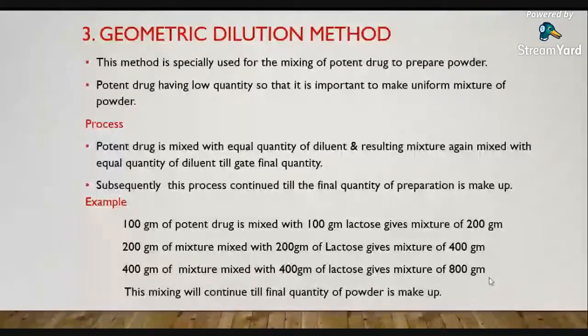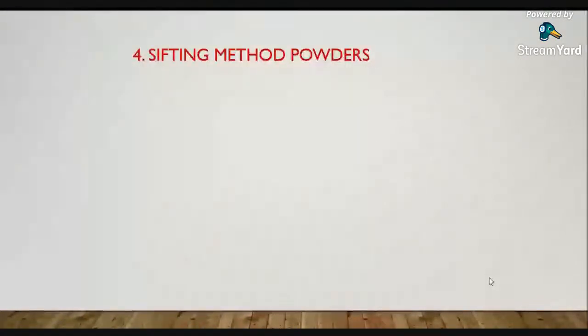Okay. Now this is the method of geometric dilution. Now the fourth method is the sifting method.